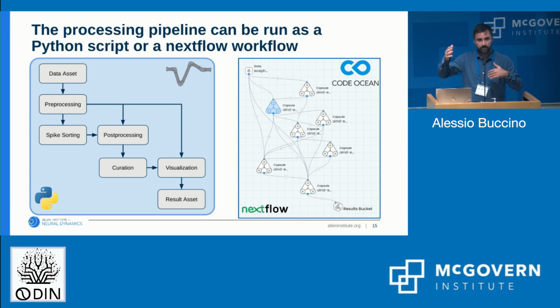And this could be further developed into a standardized schema that could also be rendered as web forms if you want to change them. So one could provide a standardized set of parameters, and if you want to change the frequency that you filter your data with, you should be able to do it. Right now, we are still working on it, but that's the idea. But that, I think, is where we need community feedback. So what parameters should we expose?